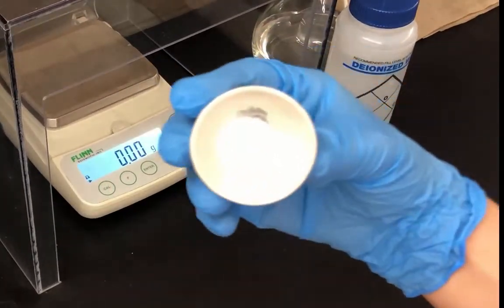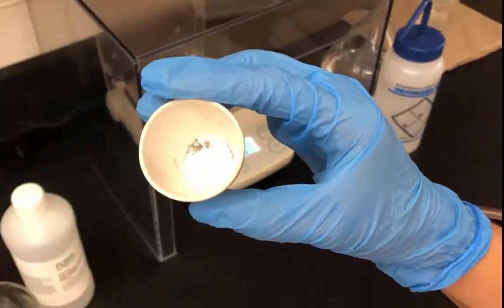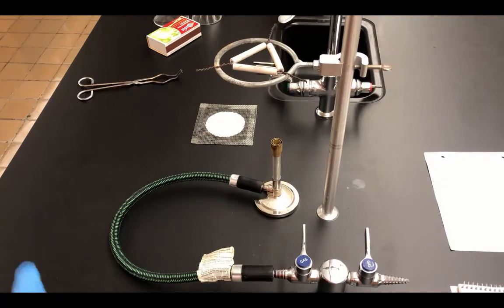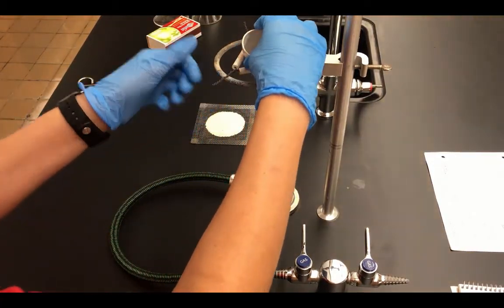Notice, again, you can make observations of the unknown. And we're going to go back and heat it again. So now we are ready for our second heating. And so I'm going to make sure to turn this.